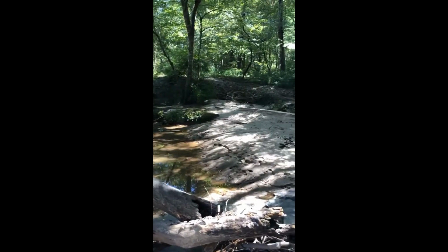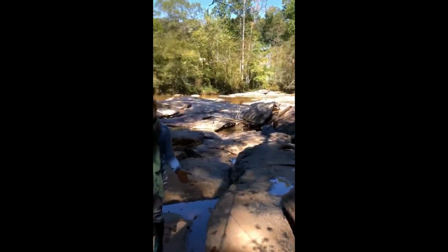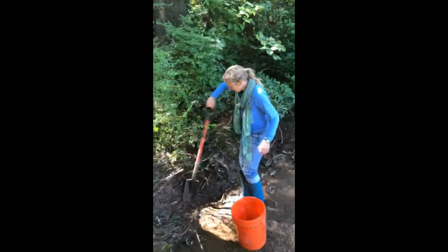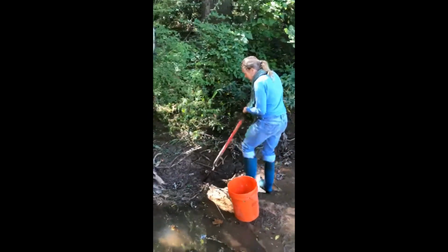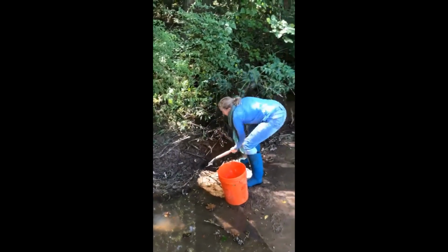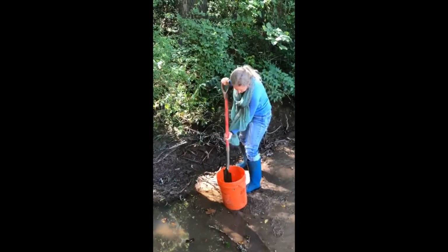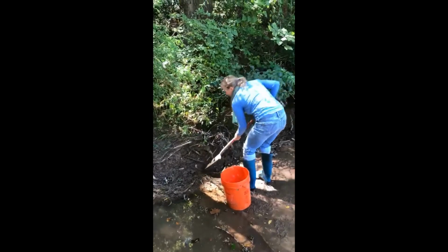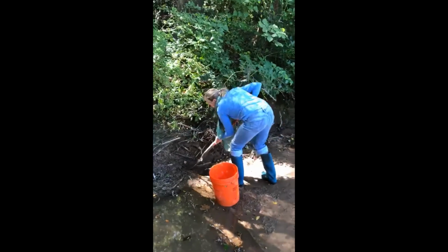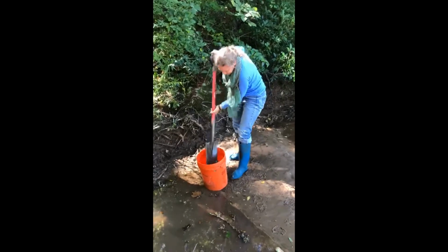That's where we were planning to get some of our mud for this experiment, but because of all of the sand, we're going to get it from the bank over here. We're choosing an area where we're thinking we're going to get some good diversity of microbes. So I'm digging into this side of the bank, and putting it in a bucket that already has a little bit of water from the middle of Coney, so that we'll have that for our experiment.